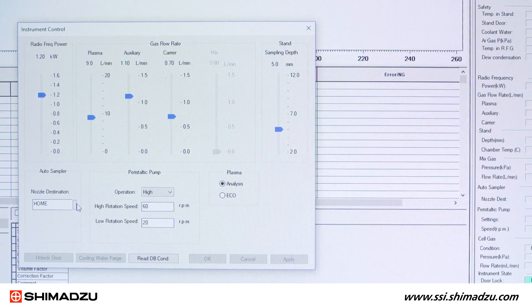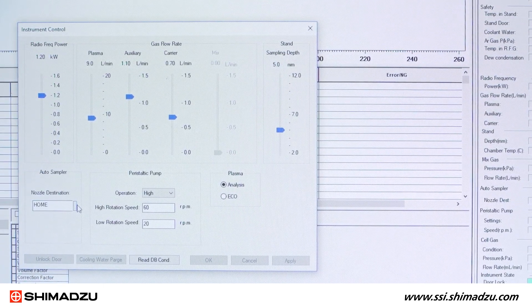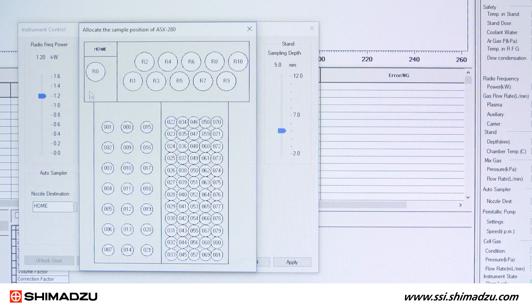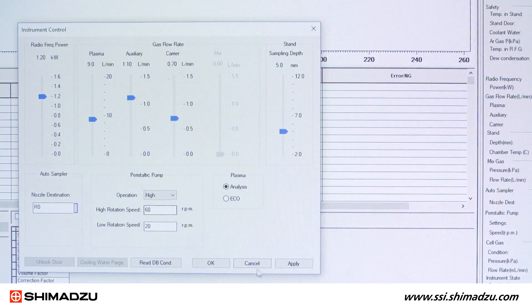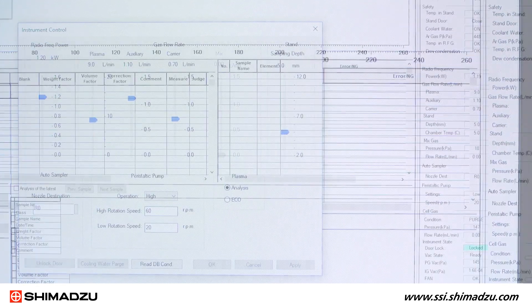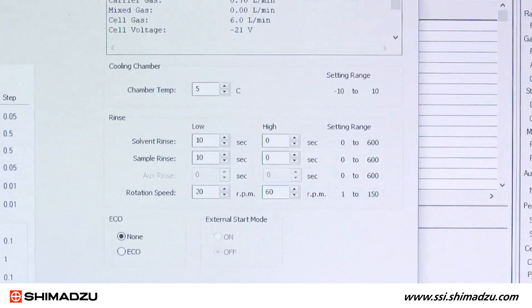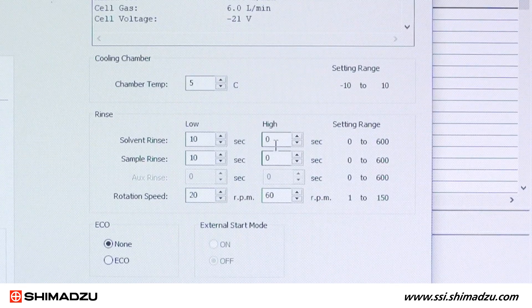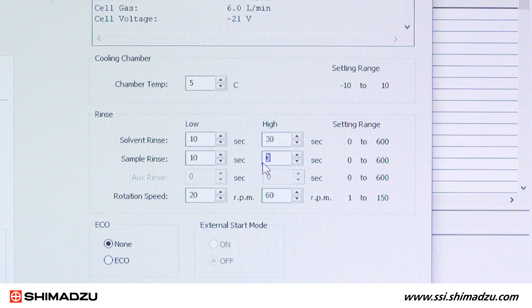Then return the probe to the rinse port by selecting R0. The minimum solvent and sample rinse times should be 10 seconds plus the time required for the solution to reach the nebulizer from the auto-sampler probe.